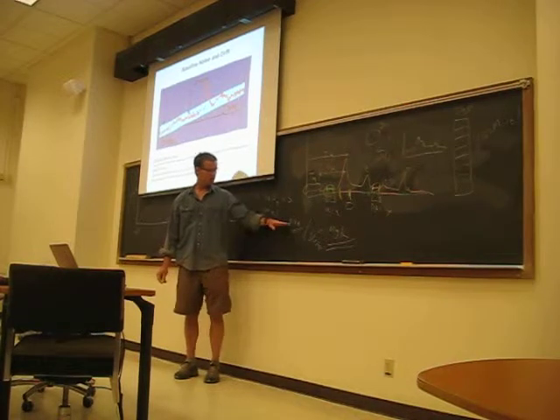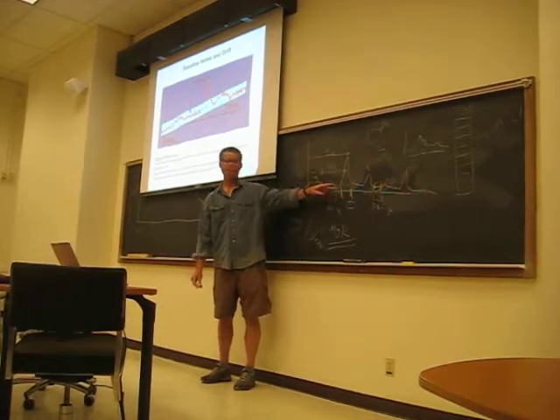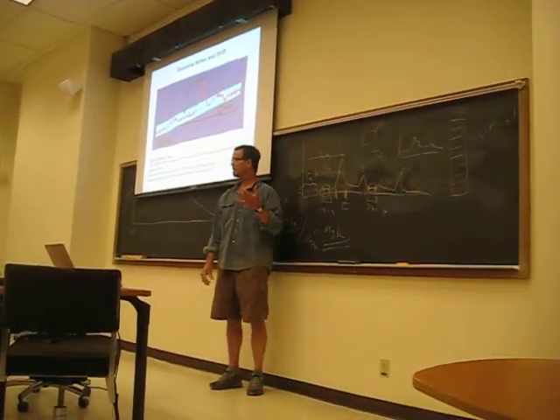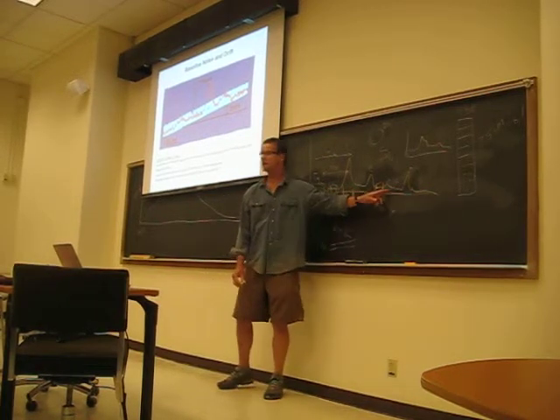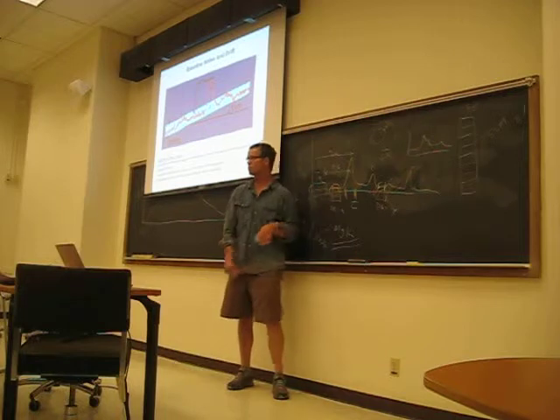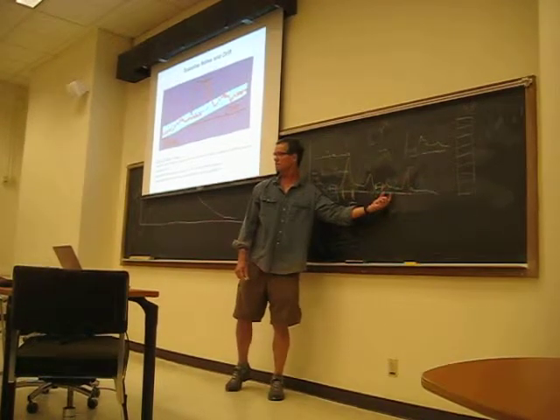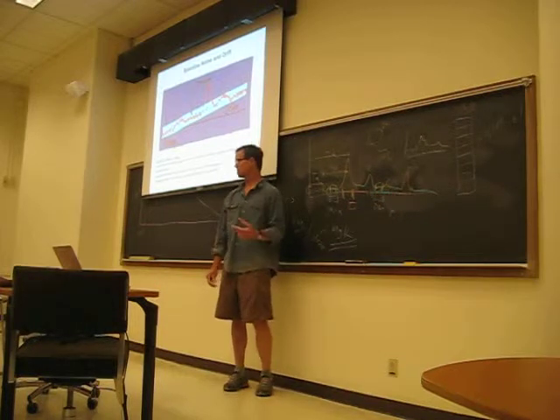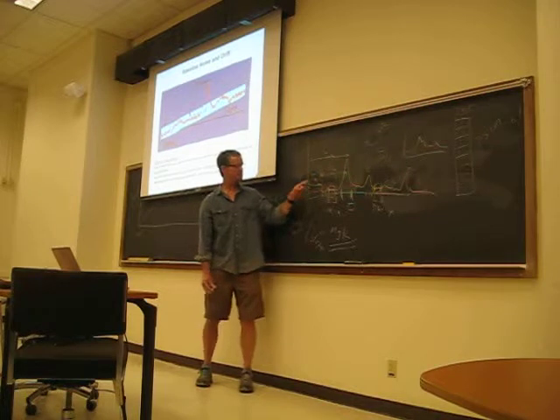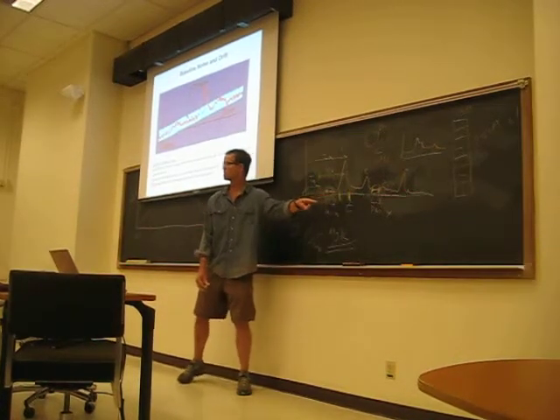So when you do this, you'd say, I'm getting all my analytes here, but my baseline noise should be the same whether it's here, here, or here. If I shoot a blank, then I can get this for each of my analytes. It should be almost the same, but I can get it for each of my analytes using that software, with the parameters I set for which areas to integrate along the elution, right? That makes sense? Yeah. So I get those different microsiemen-minute peak areas for each of those along the baselines.